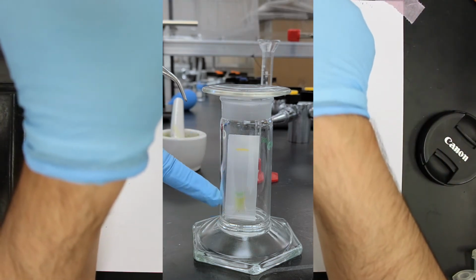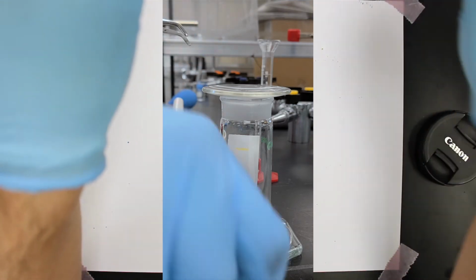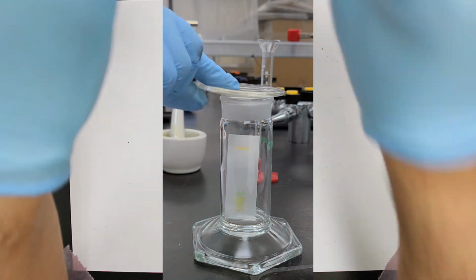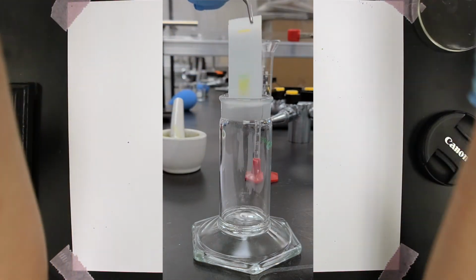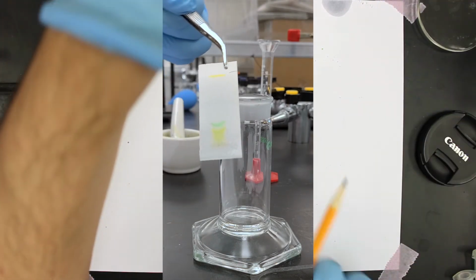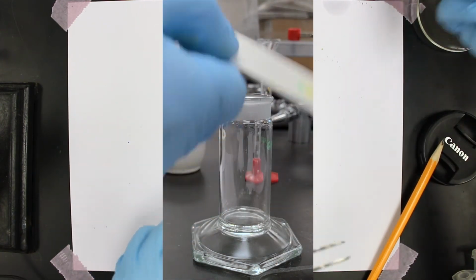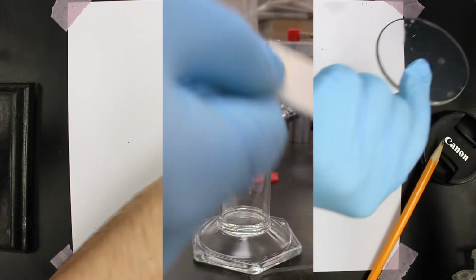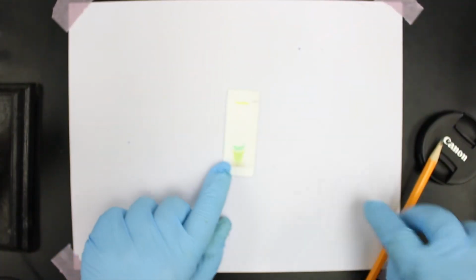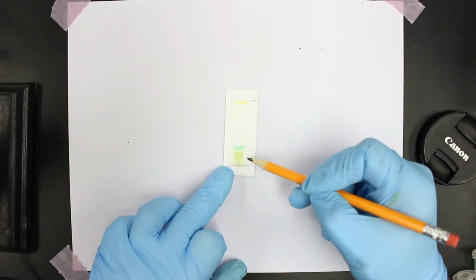So the portion of the plate that is dark and gray indicates where the solvent has traveled. And since the solvent will evaporate once we take it out of the chamber, we can't wait for it to evaporate. We need to do it immediately. So let's quickly take that off and mark about where the solvent ended. And it's not a super exact science. So now what we can do is we can shake the plate a little bit, maybe let it evaporate. Okay, and now as you can see on our plate, we have some very good separation. Well, not very good, but some decent separation of all the compounds.